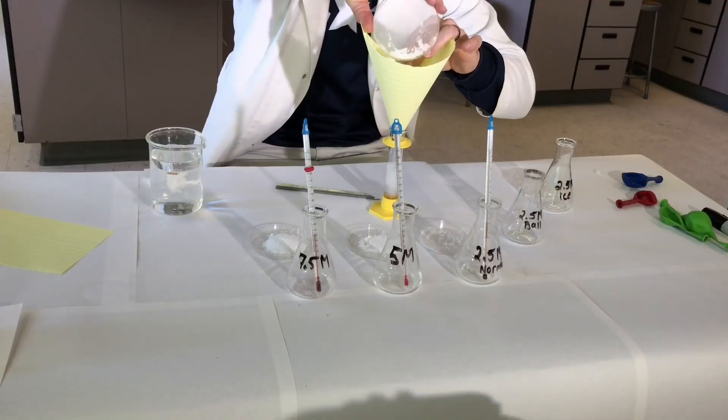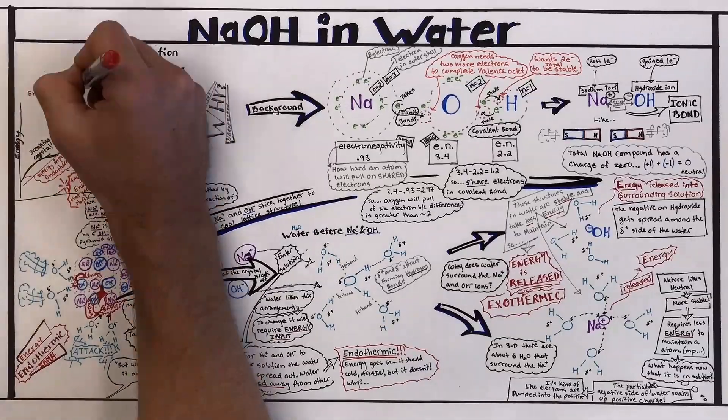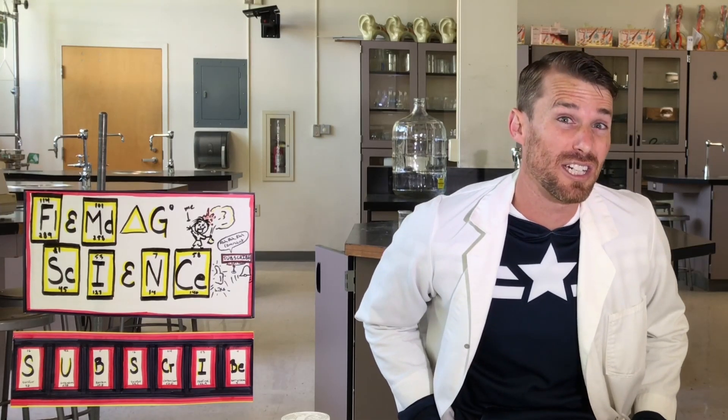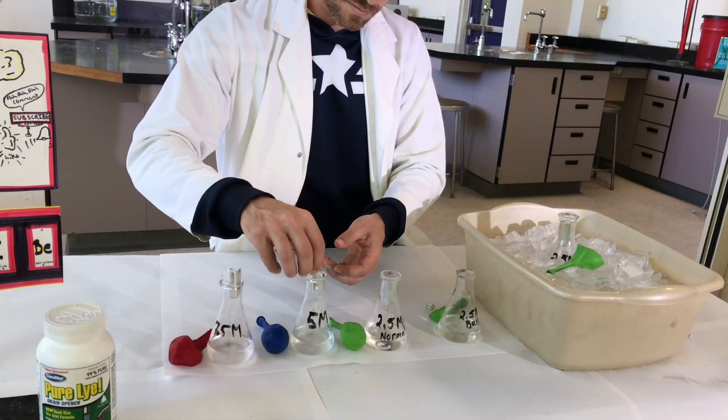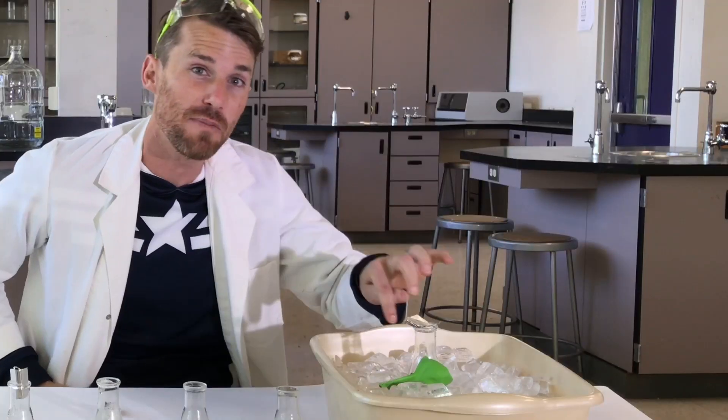What are we actually going to do today? First, we're going to drop sodium hydroxide in water, measure the temperature, and I'll explain it. Then you'll wonder how we made that sodium hydroxide solution, so I'll give you the quickest molarity and concentration lesson of your life — looking at how to make 2.5, 5, and 7.5 molar solutions. Then we drop in half a gram of aluminum into three beakers of different concentrations with the same surface area of aluminum exposed. One beaker gets a lower surface area by crumpling the aluminum into a ball. One beaker's on ice. We measure reaction rates by how quickly they fill up balloons. Then I explain what we saw. Then I light the balloons on fire. Then I say bye.